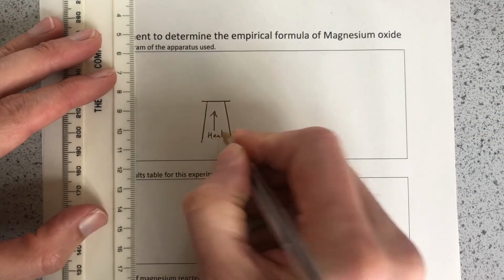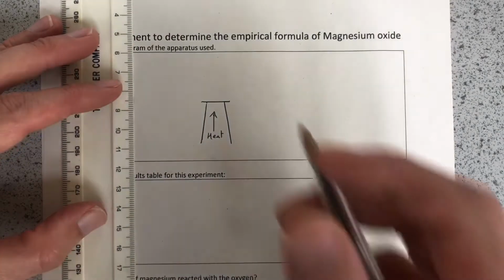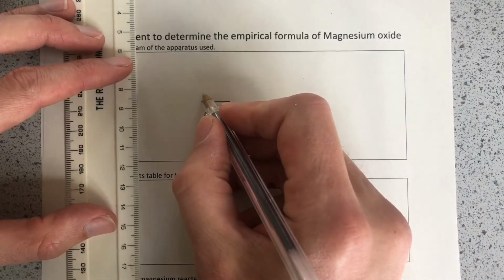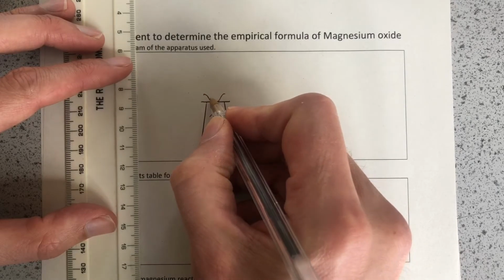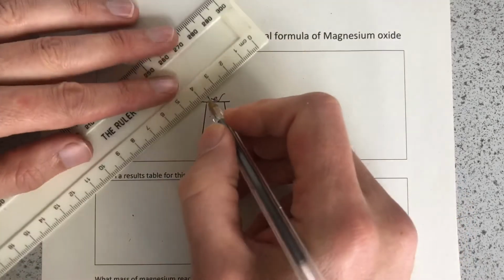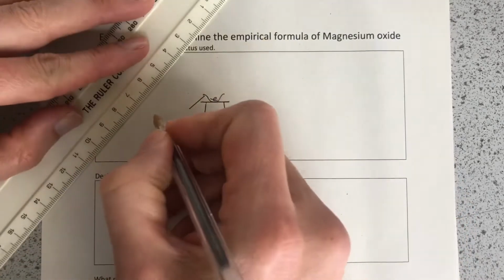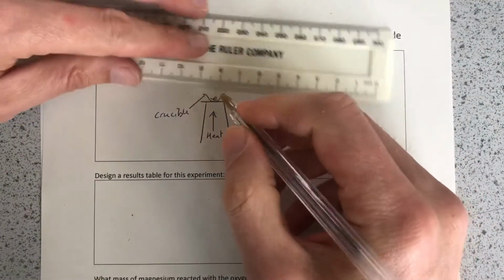So we're not going to use a gauze, we're going to use a pipe clay triangle, and I'll show you one of those in a moment. Now on that pipe clay triangle we're going to put a crucible, and a crucible is a little ceramic dish, and in that ceramic dish we're going to put our magnesium ribbon. So let's quickly label that up as well. That's a crucible, and that's our magnesium ribbon.